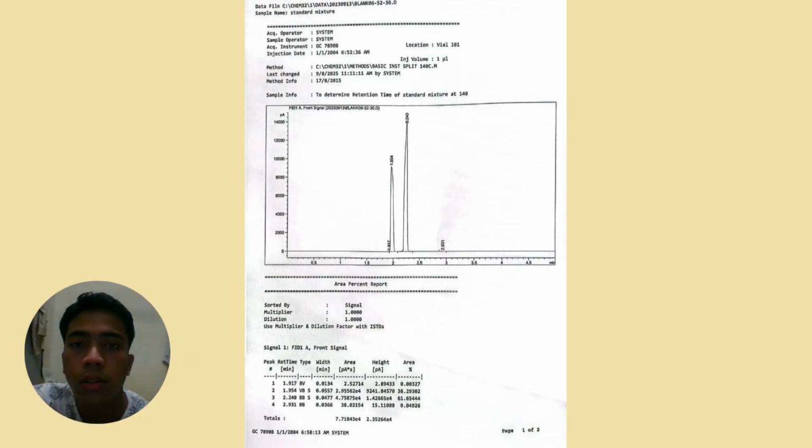There are four peaks recorded, where the highest peak is the third peak, where the retention time of the highest peak is 2.240 minutes, and the percentage area of it is 61.65%, and the height of it is 1.42665 times 10 to the power of 4.